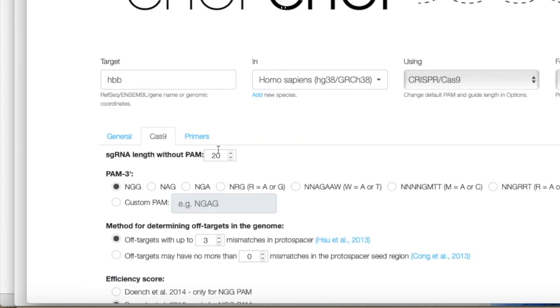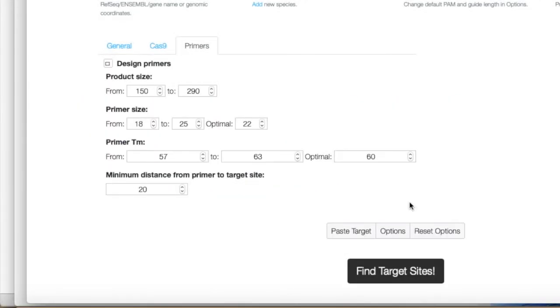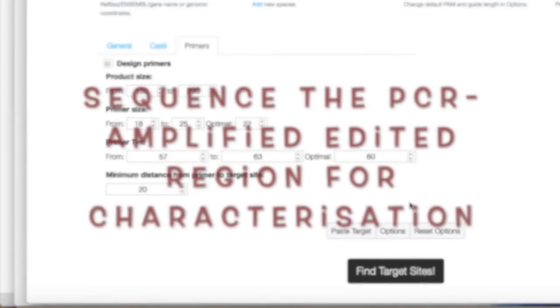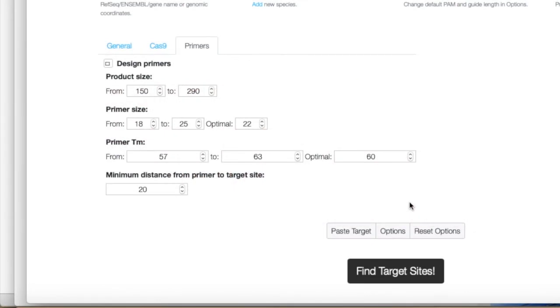CHOPCHOP also has a primers tab for designing PCR primers to amplify the region you're targeting with Cas9. After your experiments — after introducing Cas9 and guide RNA into the cell — you'll need to characterize what edit Cas9 created: what insertion or deletion occurred, and whether it causes a frameshift to knock out the gene. For a knock-in, being able to amplify and sequence that region is essential for validation.